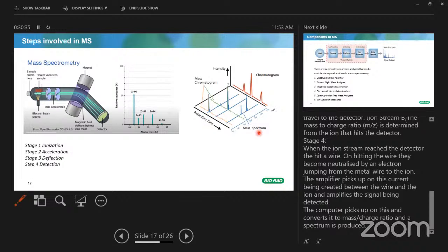So you get not only the compounds separated, but also the structure of each compound identified. That is where this combination of LCMS or GCMS has given much fillip to research and industrial use, not only for understanding and analyzing, but also for arriving at a structure with this technology.